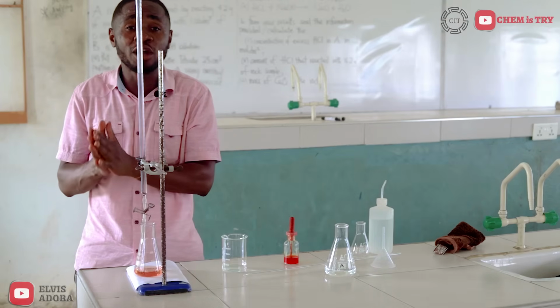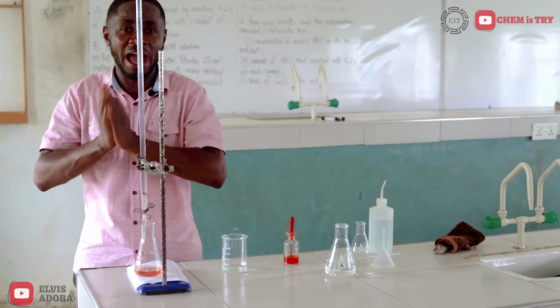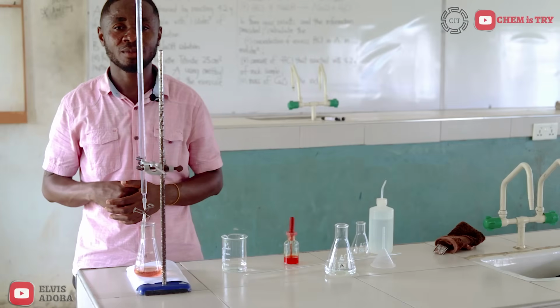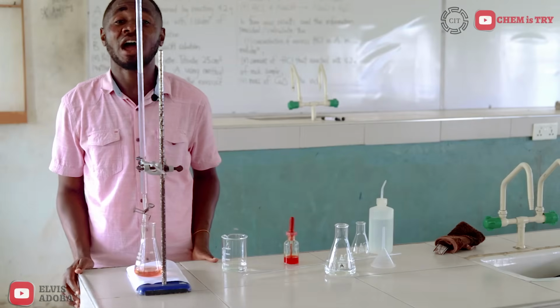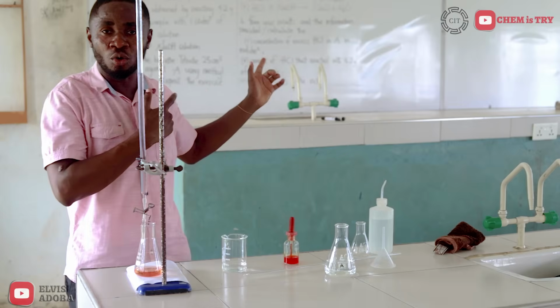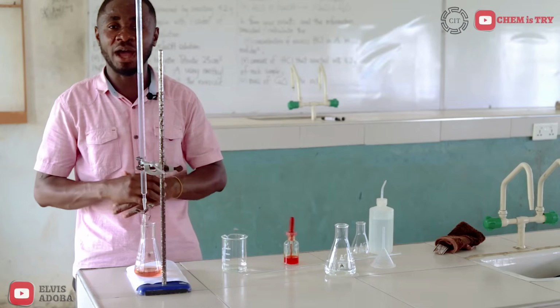After all, I'm going to calculate the average volume of acid used using only 2 titer values. So if the first 2 are around the same figure, then that is where my actual titer value is supposed to be. So let's go back to the board and prepare a table for our titers.